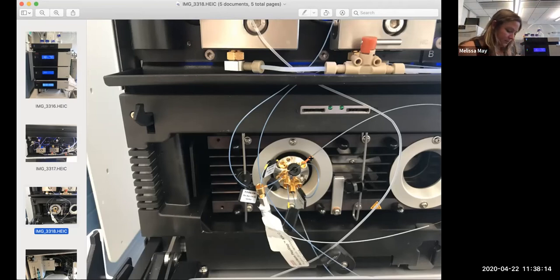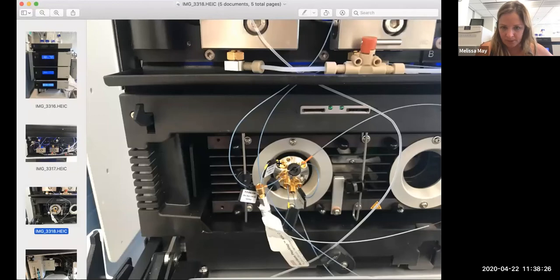And depending on what position these different valves are in, depends on how stuff flows through the instrument, okay? And so if we look at this, this is valve one, this is valve two, valve three, four, five, six, seven, eight, nine, 10, okay? So there's 10 there. This one right here is in 10. What we have going on here is, which is kind of hard to see. Oh, I don't have my video. Wrong one up. Up here, we have a line, this one right here, that is coming from the nano pump.